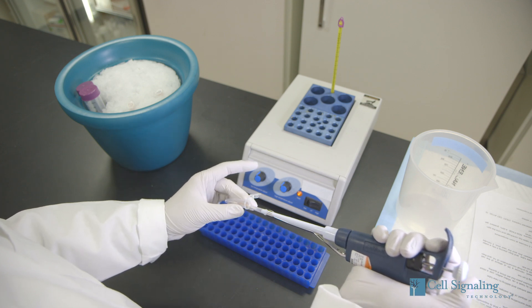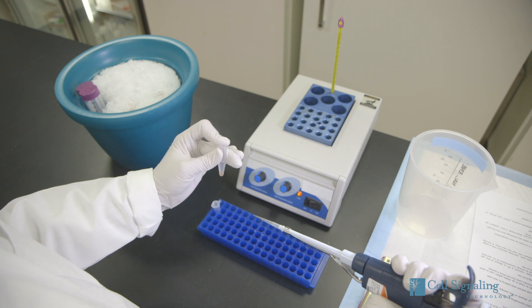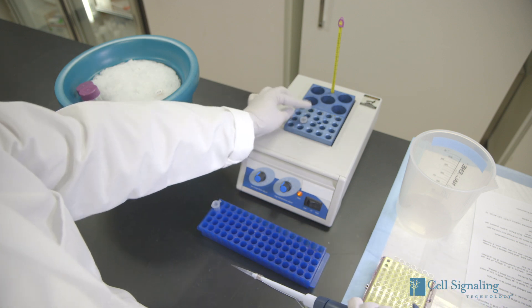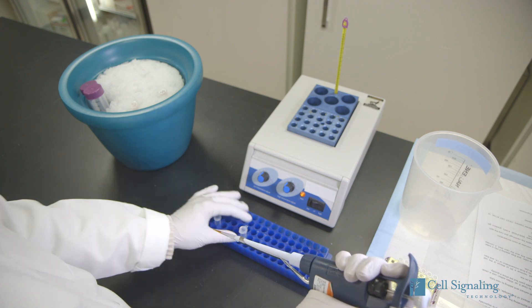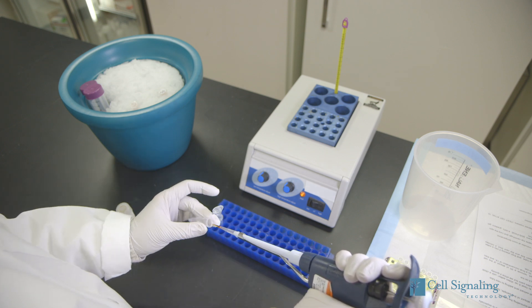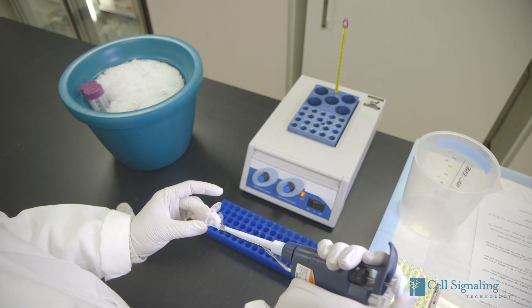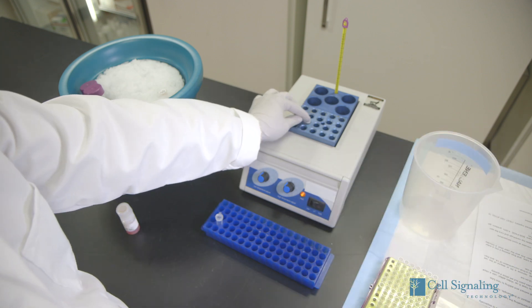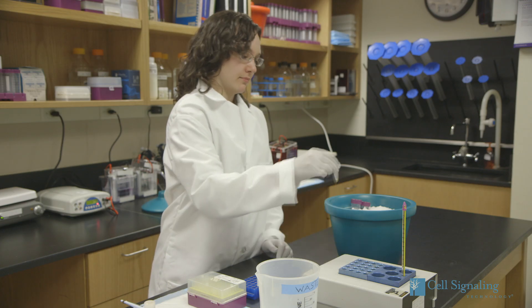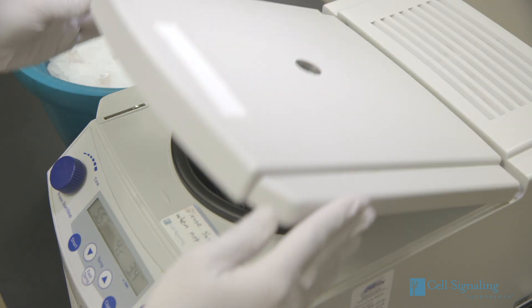If SDS sample buffer was used, take a 20 microliter aliquot of the sample, heat it to 95 or 100 degrees Celsius for 5 minutes, and then cool on ice. If cell lysis buffer or RIPA buffer was used, remove a 20 microliter aliquot of the cell extract, add red or blue loading buffer pack to a final concentration of 1x, and then heat the sample to 95 degrees Celsius for 5 minutes and cool on ice. Now, microcentrifuge the cooled samples for 5 minutes at room temperature.